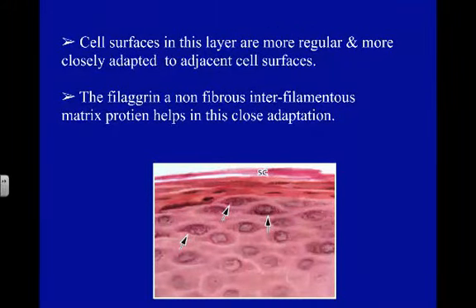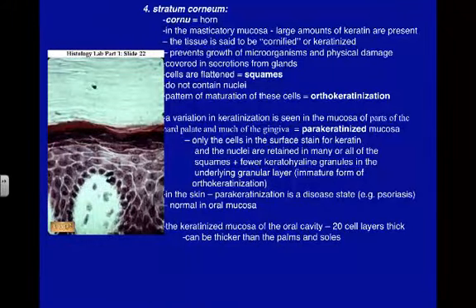All right, lots of regular tissues. Okay. Now, when you see parakeratinized epithelium, they're really on the hard palate. It is considered normal. You can see parakeratinized epithelium in regions of the gingiva. You can see parakeratinized epithelium on the skin.